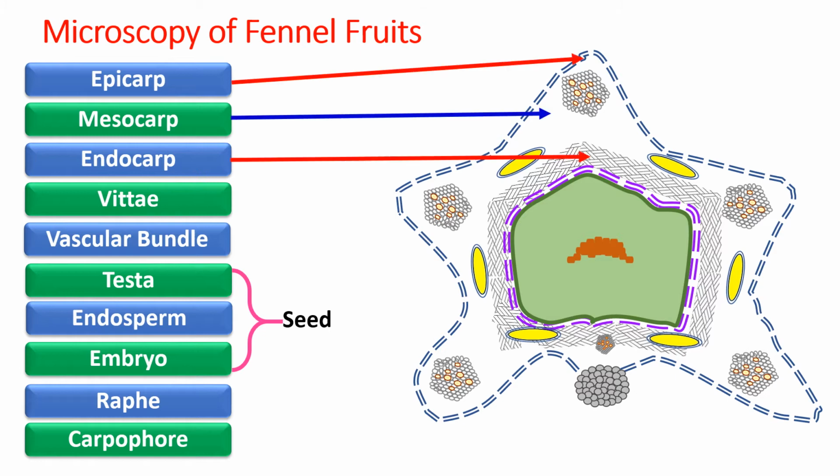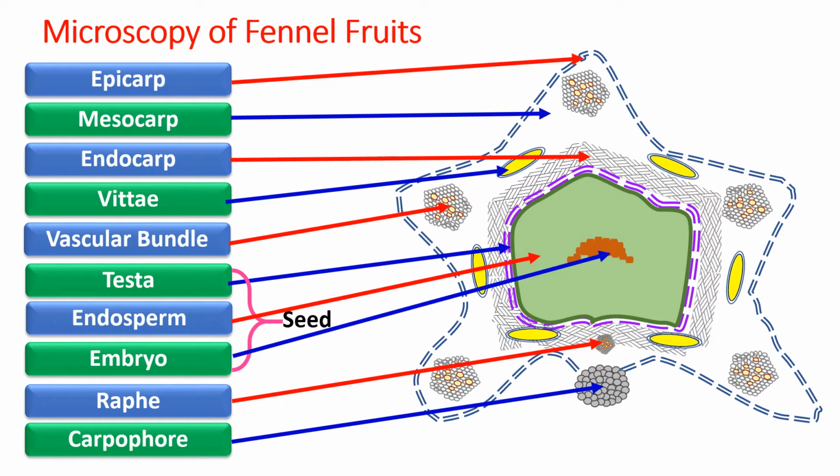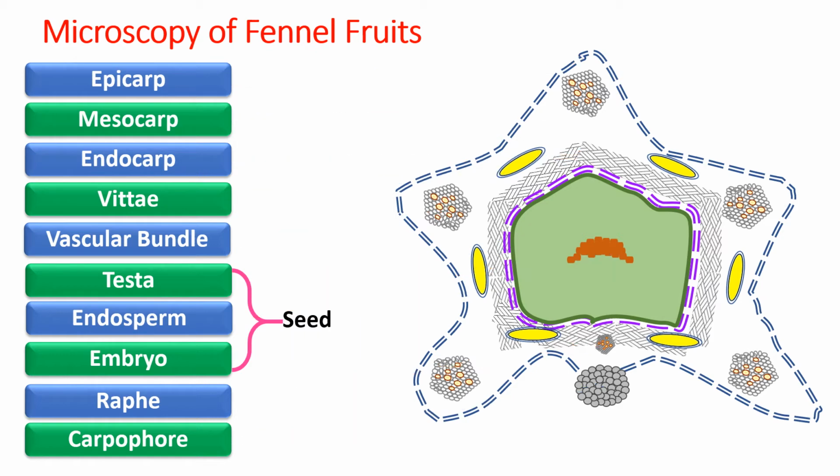These are the different layers. If you want, you can take a screenshot so as to maintain it. It will help you during the last minute revision for the examination. So these are the different layers and their locations. Now we'll have a look at the staining of this.